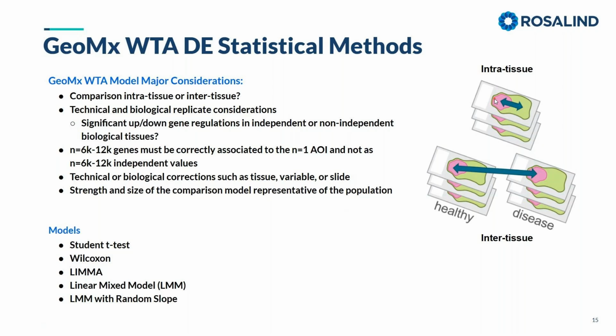It actually thinks those are all unique samples taken from different patients or different tissues or different cell lines. So it thinks they're unique samples and not within the same tissue, which is this unique spatial model here. They're actually within the same unique tissue, and so they're non-independent. They are all dependent on each other here.